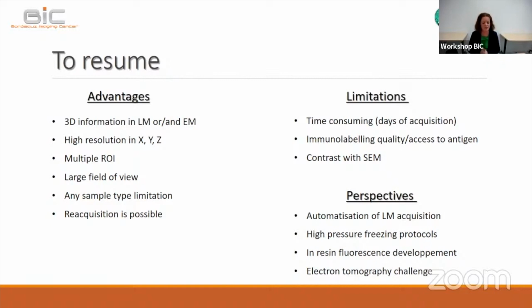The limitation is, of course, the time that you need to make one experiment. It's really days of preparation, days of acquisition, so it's quite long. But now it's already automated for the SEM.